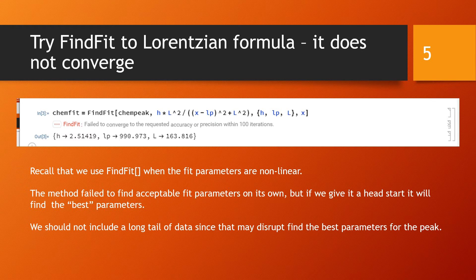Some of the fitting parameters in the Lorentzian form are non-linear, therefore we will use the FindFit method. The FindFit method has four arguments. The first argument is the data that we are fitting, so that's ChemPeak. The second argument is the functional form to which we are fitting, that's the Lorentzian already discussed. The third argument is an indication of which quantities are to be fitting parameters, so that is the curly brackets with the h, lp, and capital L in there. And the fourth argument is which quantity is to be seen as the variable, and that is the x.